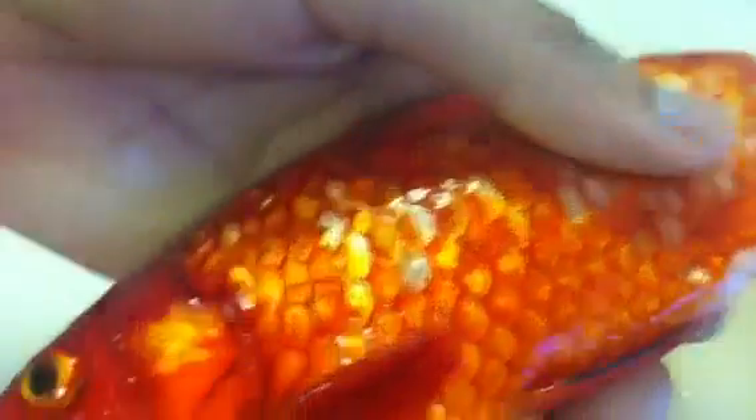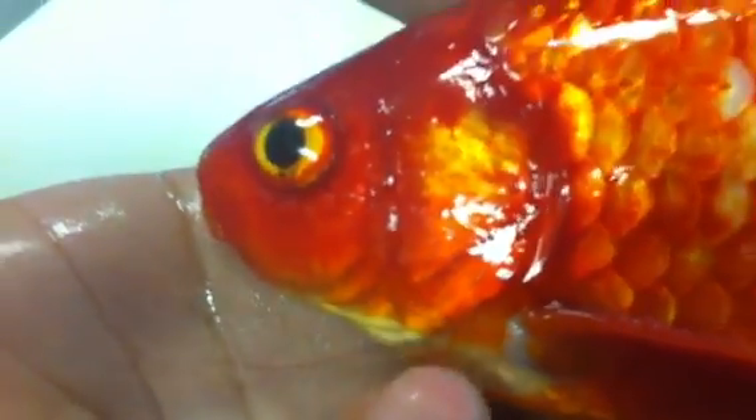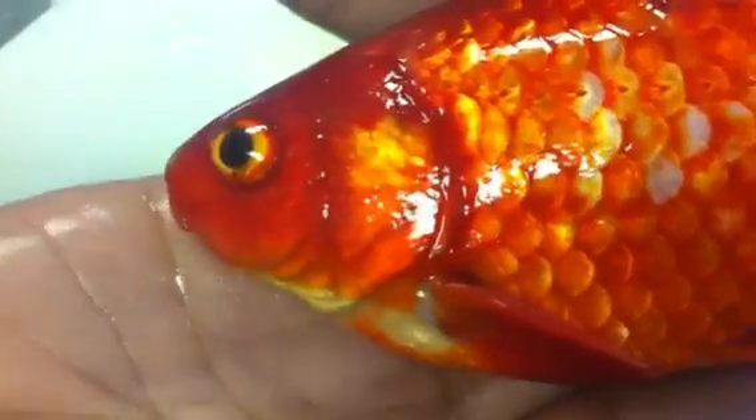You can tell that it's a male goldfish because if you look at the operculum, you can actually see some of these raised white spots here. And also on the pectoral fin, which is a lot more apparent in the water.